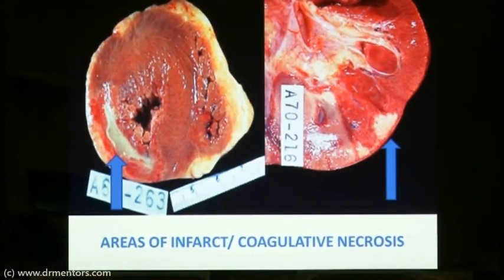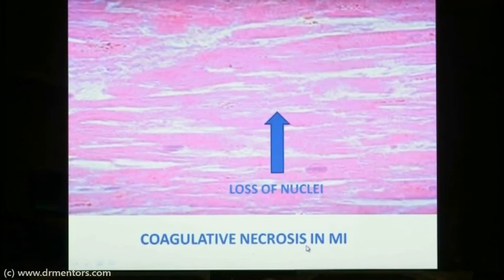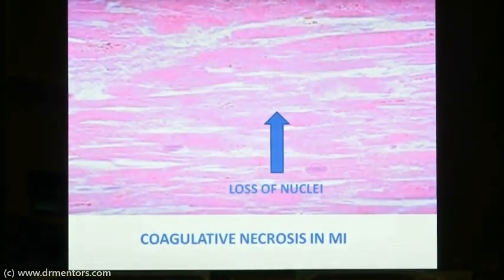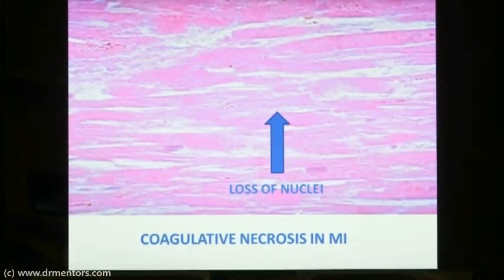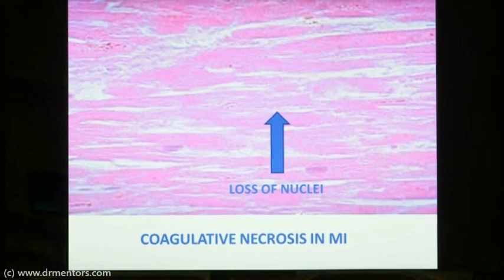Now we will look at the microscopy of the same infarcted area showing coagulative necrosis in myocardial infarction. Coagulative necrosis is characterized by the preservation of the architecture of the cells — you can appreciate that these are cardiac muscle fibers with easily visible outlines. However, the nuclei are lost; you can see only one or two nuclei, while the rest of the muscle fibers show no nuclei. This loss of nuclei along with preservation of cellular architecture is the characteristic feature of coagulative necrosis.